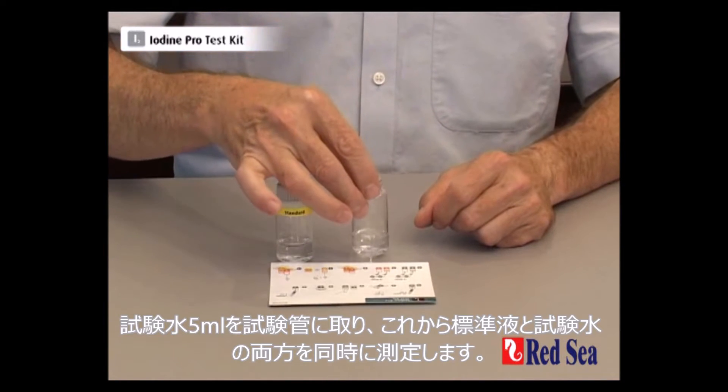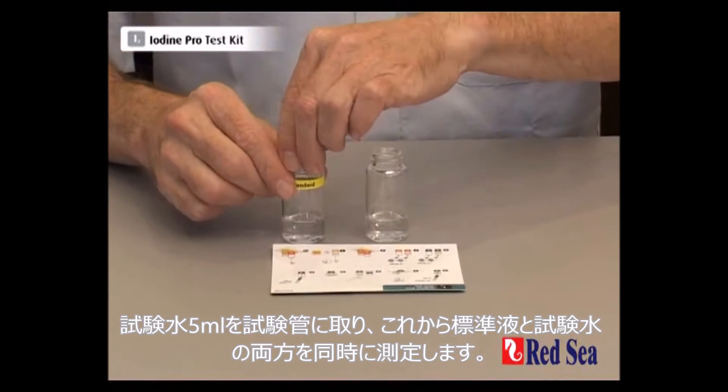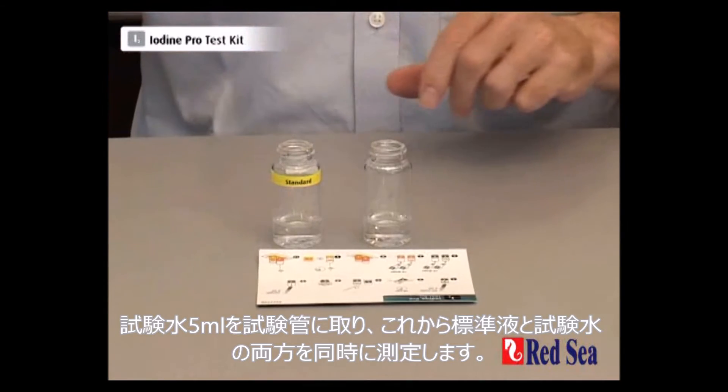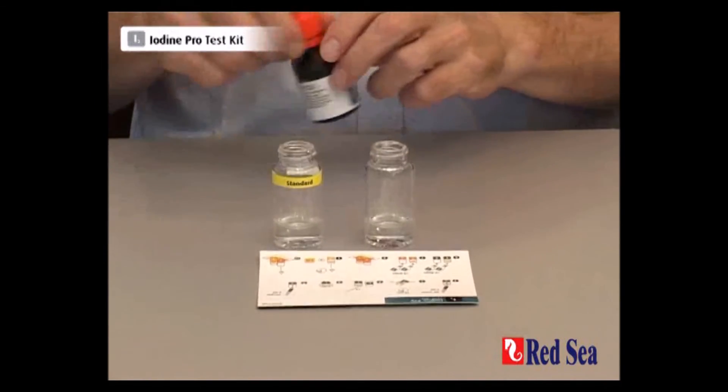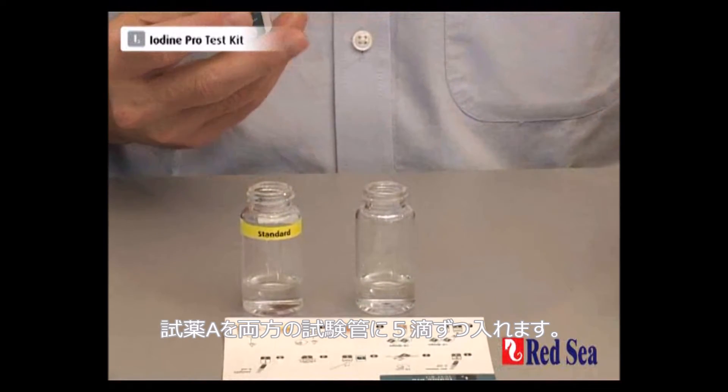I've already prepared a sample of water with 5 ml and we now do the test on both the standard solution and the water sample simultaneously. We start with reagent A and we're going to add 5 drops to each vial.